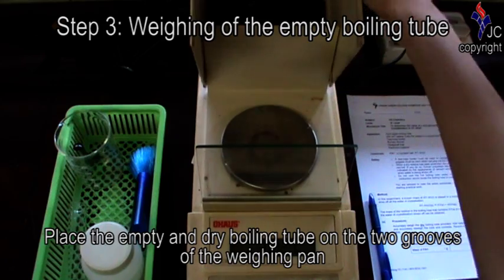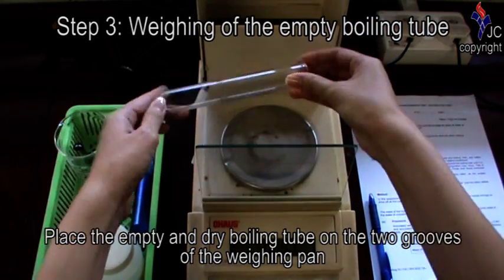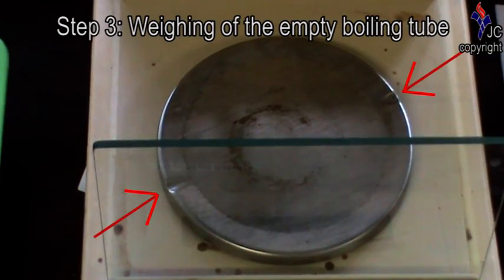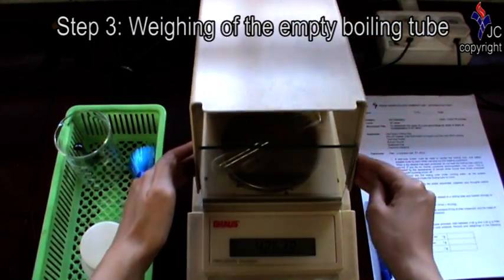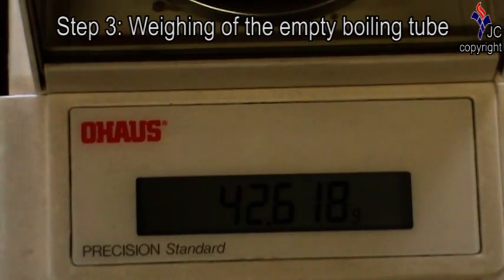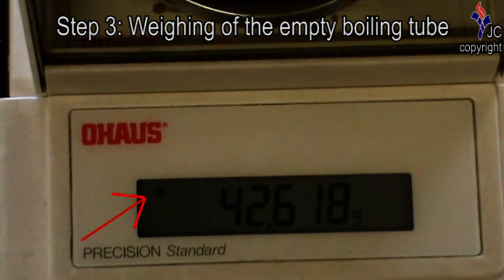Place the empty and dry boiling tube on the two grooves of the weighing pan to prevent it from rolling off. Close the cover of the weighing balance. An asterisk sign will appear indicating that the mass reading has stabilized.